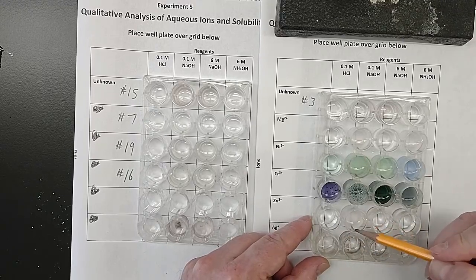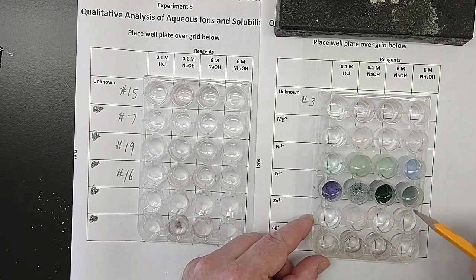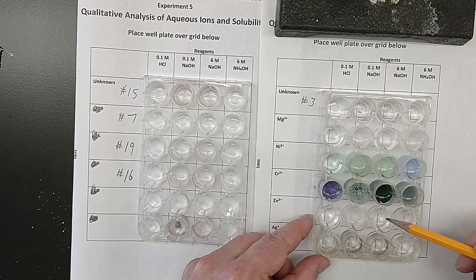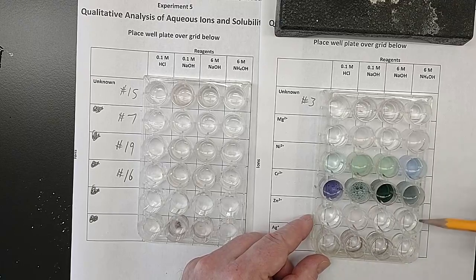The sodium hydroxide 0.1 molar is definitely cloudy and white. The 6 molar sodium hydroxide, back to clear and colorless. And ditto for the ammonium hydroxide. It's back to clear and colorless. So that's different than the magnesium.